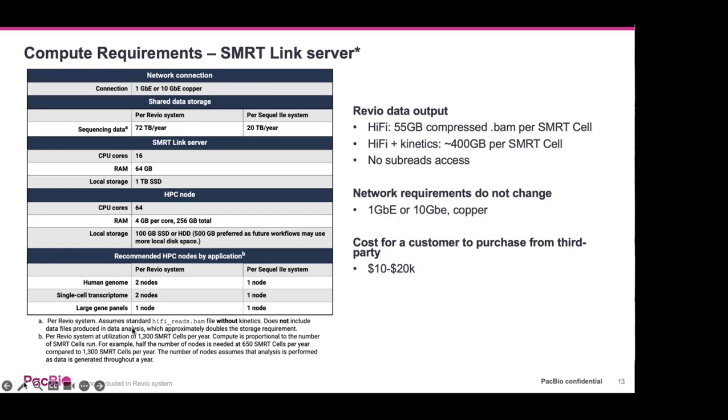We are working on revised guidance for this, but I checked and it wasn't quite ready for this presentation. But I think a new, smaller set of requirements that's more budget friendly is coming out, so look out for that. That'll be published into Seismic when it's ready. Network requirements: you'll want at least 1 gigabit copper, optimally 10 gigabits.